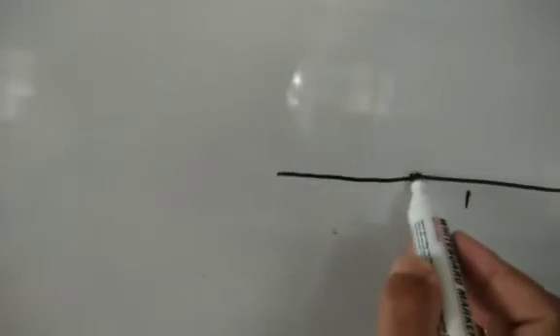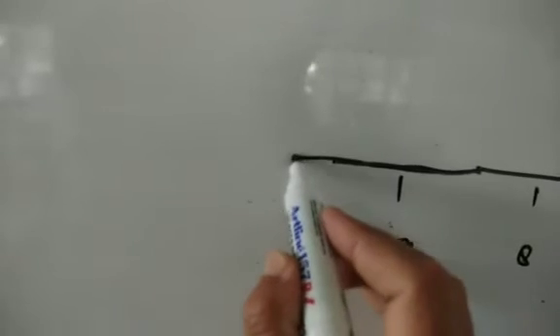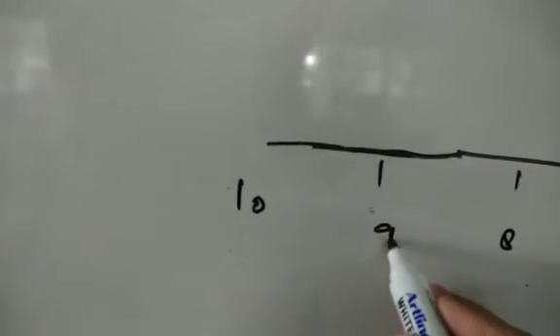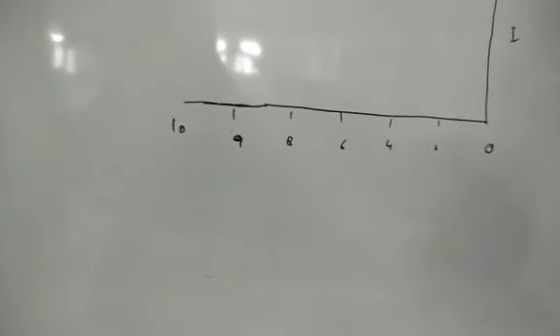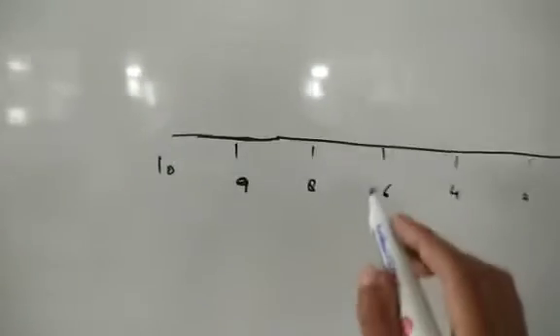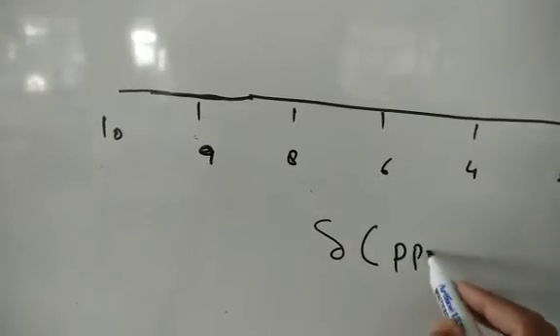Exactly जो कल वाला लेक्चर है, if you have missed that, please follow that part number 1 of this. So this is 9 and this is 10. Scale जो होती है 1H के लिए almost it's from 0 to 10, 12. Carbon 13 के लिए this is around 200 and so on. So this scale is delta, that's chemical shift. It is in parts per million.